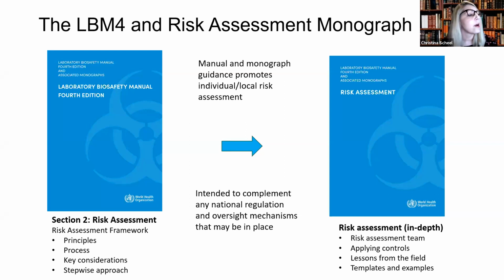The monograph provides in-depth information about RA and builds upon the principles and practices in the core document to include a risk assessment team, which we won't really discuss today, but it's quite important, the applying of controls to reduce risks, which we will talk about quite a bit today, sharing of lessons in the field, and it provides blank and completed RA templates as well. And so we're going to actually use those today during this session.